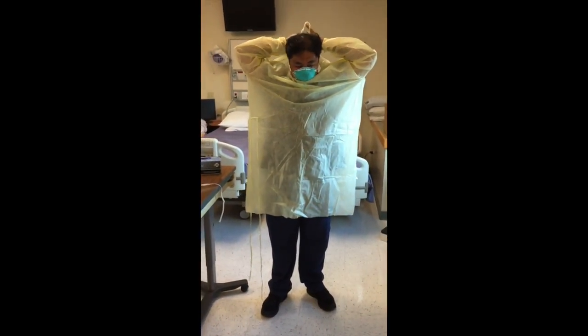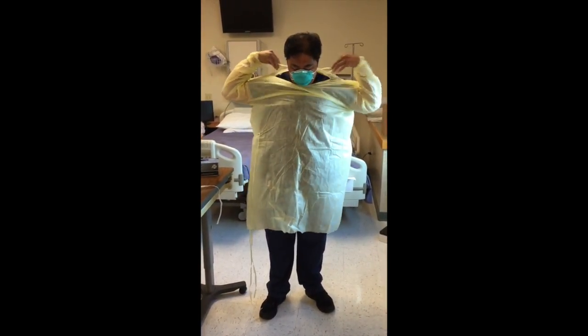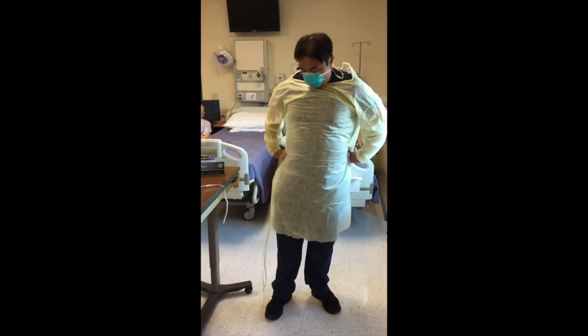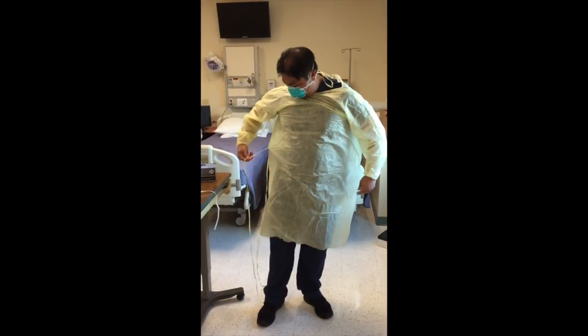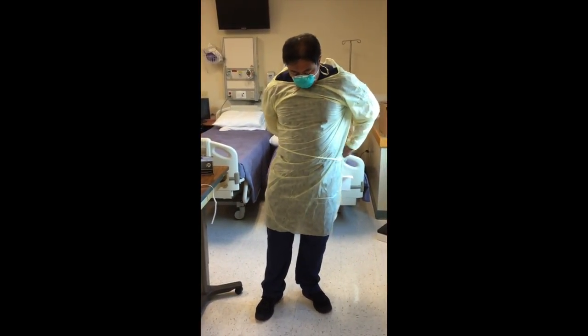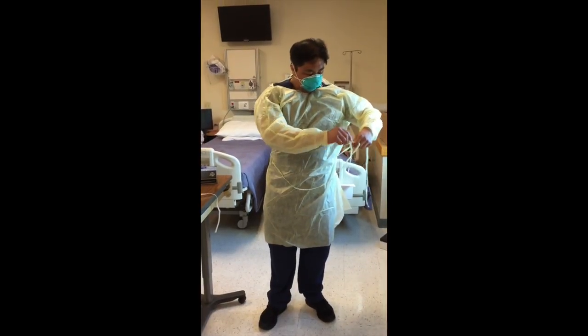So you put it up here, and you also tie it in the center.